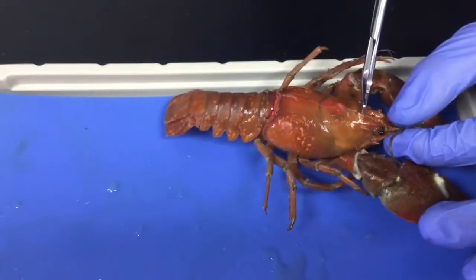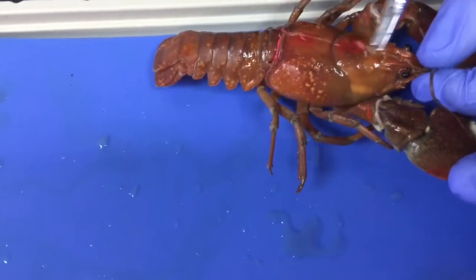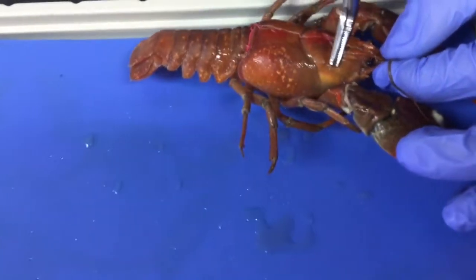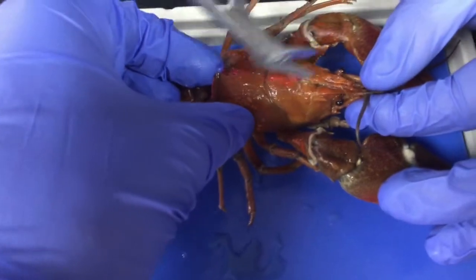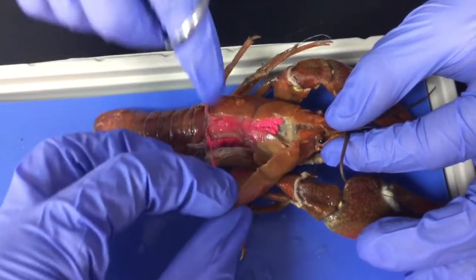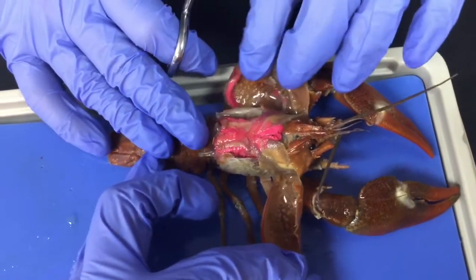Then we're going to cut a transverse cut just behind the eyes so that we can just take the carapace off, like opening up a wallet. You can see the carapace kind of coming apart here, separating. You're going to cut all the way down, Ethan, as far as you can. That worked. Yep, like that. We're just going to peel it back and expose the tissue underneath.